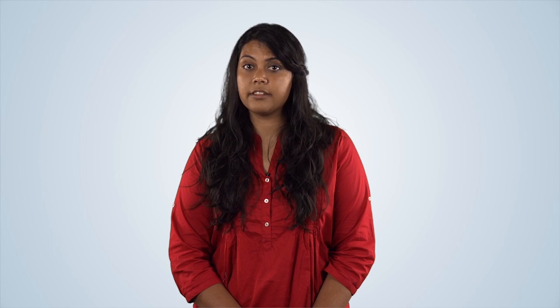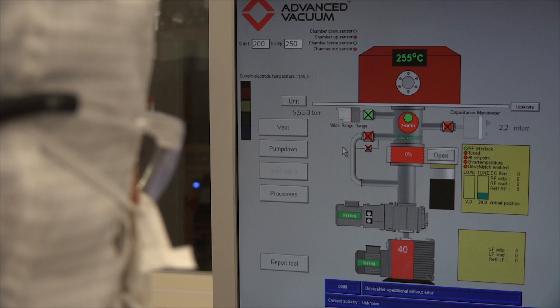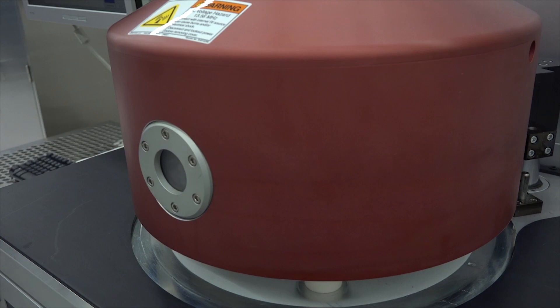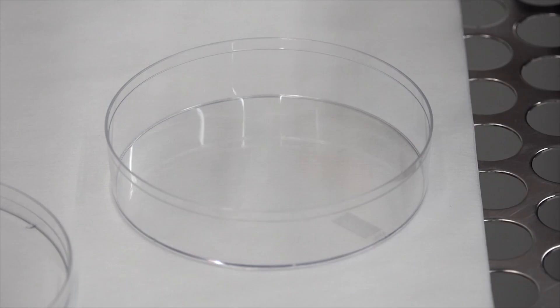The system will then go through a few cycles where the remaining gases are pumped out and clean nitrogen gas is pumped in to remove the reaction gases. Next, we select Vent on the computer to vent the chamber to atmospheric pressure. And nitrogen gas flows into the chamber and the red dome automatically lifts. We can now remove our sample.